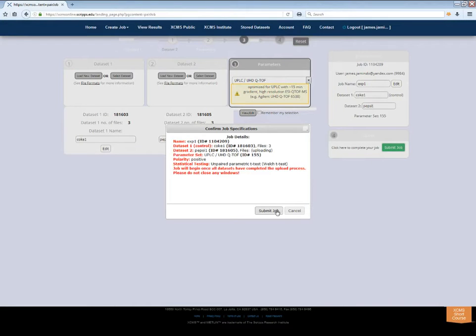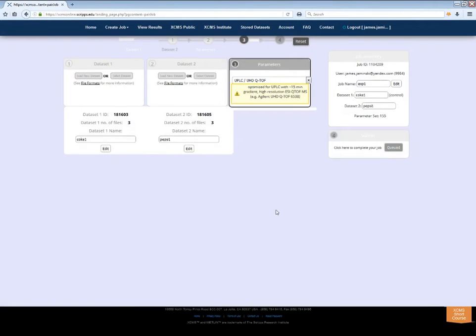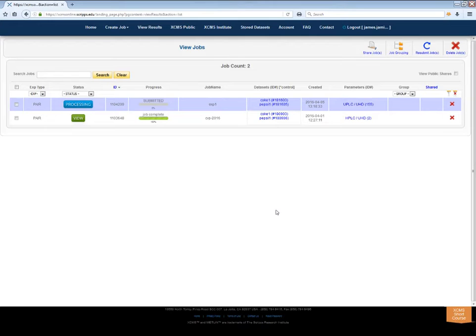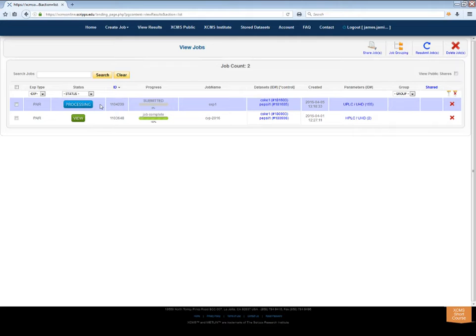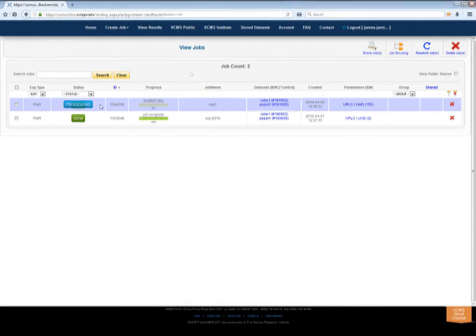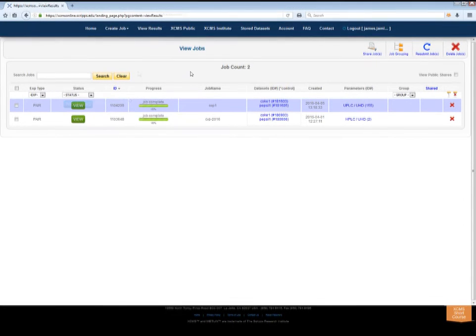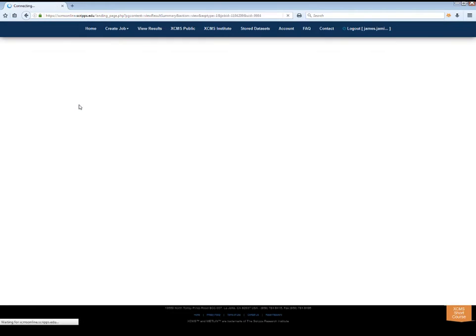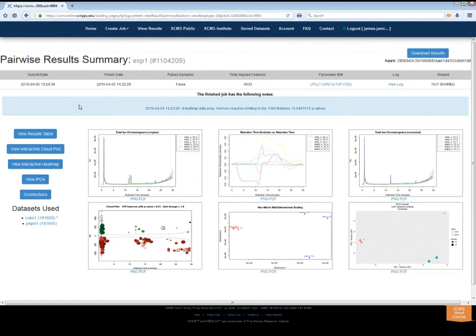You will now be redirected to the View Results page. Your newly created job will be labeled as Processing. We will send you a notification when it is complete. Once finished, the blue Processing label will turn into a green View button. Click it to access XCMS Online's visualization tools.